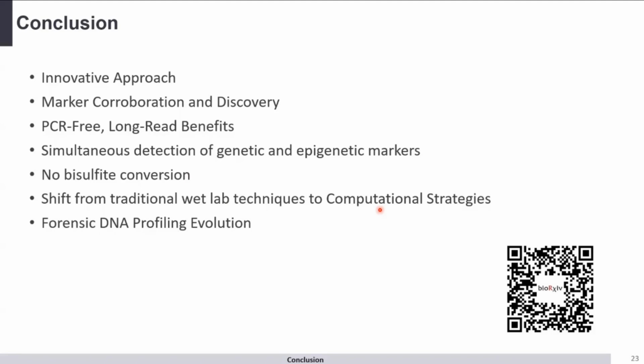Nanopore sequencing has the potential to transform forensic DNA analysis. Few portable nanopore sequencers like the MinION could become all-in-one forensic DNA profiling devices. This would enable the simultaneous analysis of biogeographical ancestry, kinship, phenotyping, body fluid identification, and age estimation of the DNA donor.